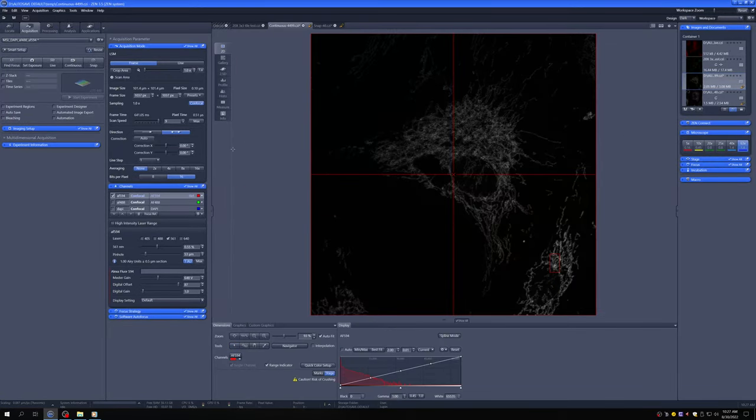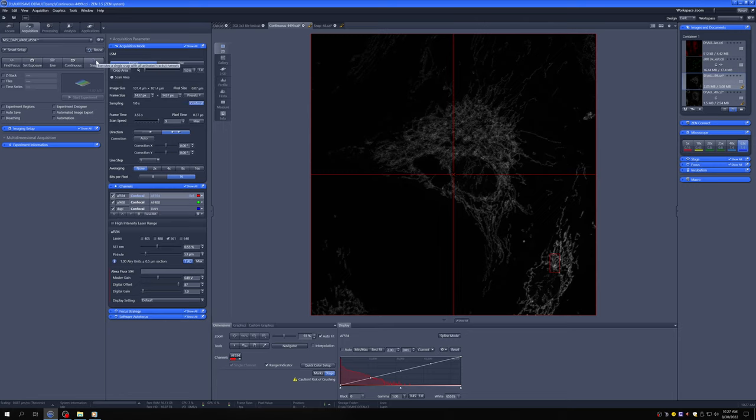At this point we've adjusted everything, so let's turn on all three channels and go ahead and snap an image.